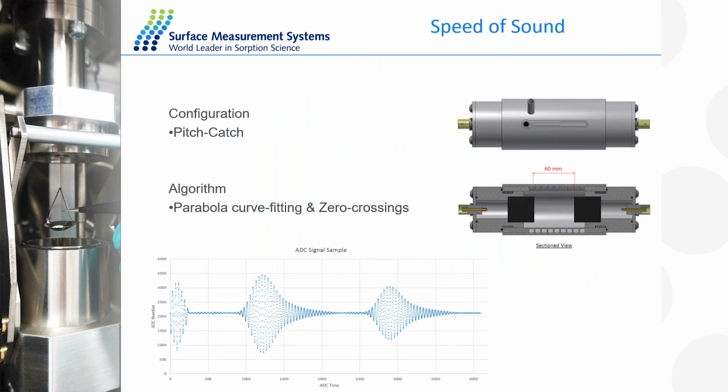So we are talking about using organic solvent to measure the property of the material, but I haven't told you how we measure organic solvent for this type of characterization. Obviously we needed a sensor that allows us to measure the concentration of different organic solvents in the presence of a carrier gas.